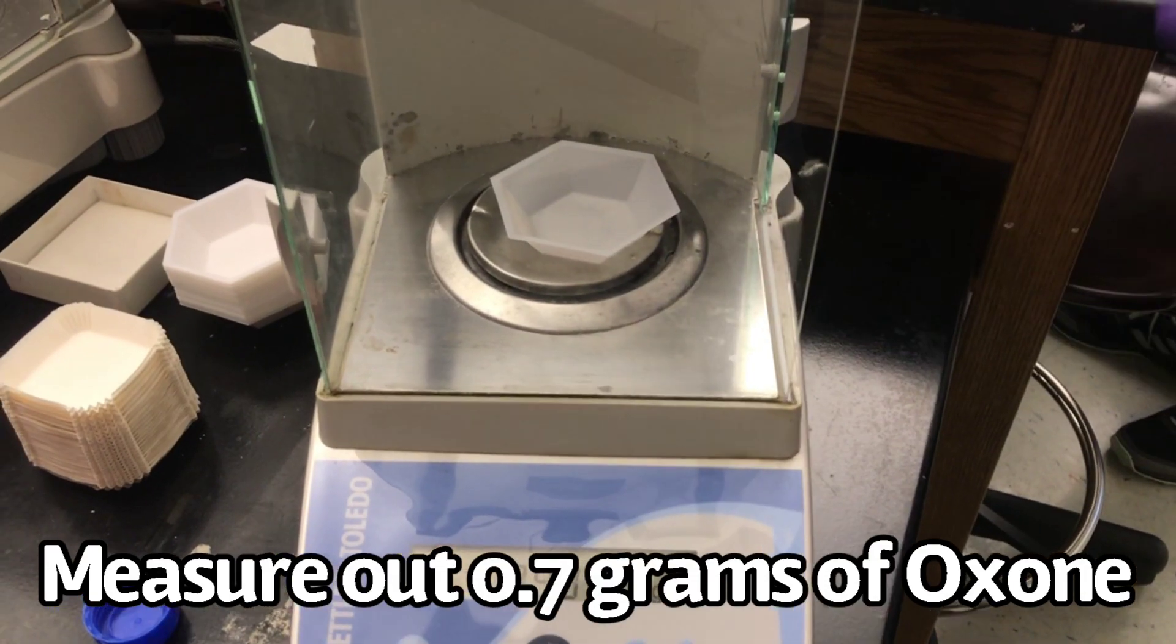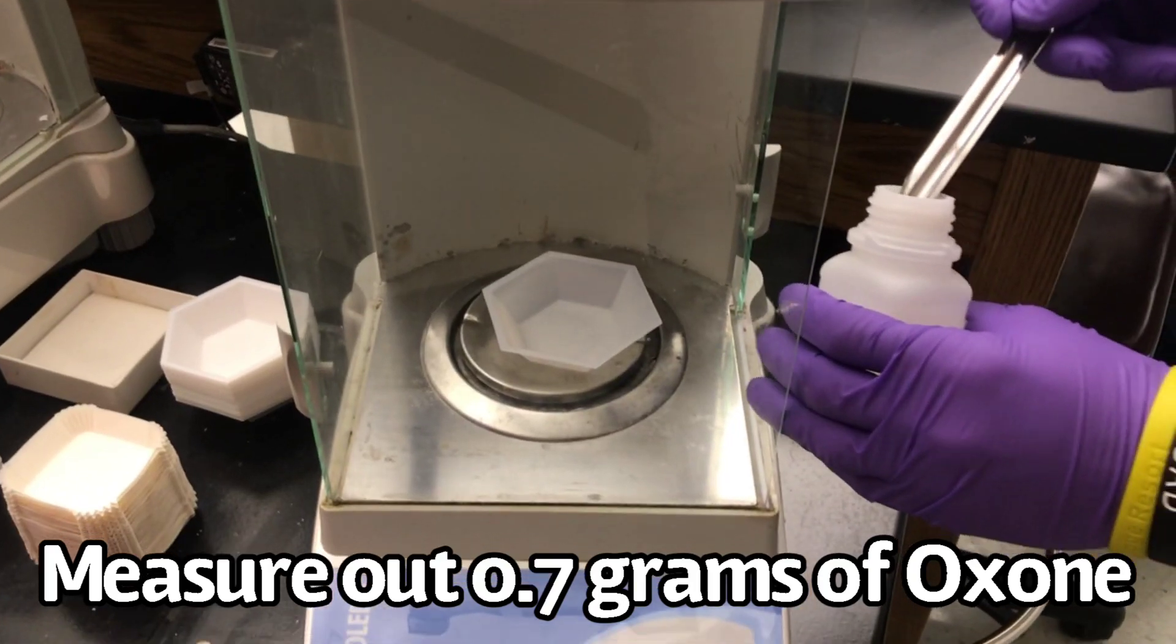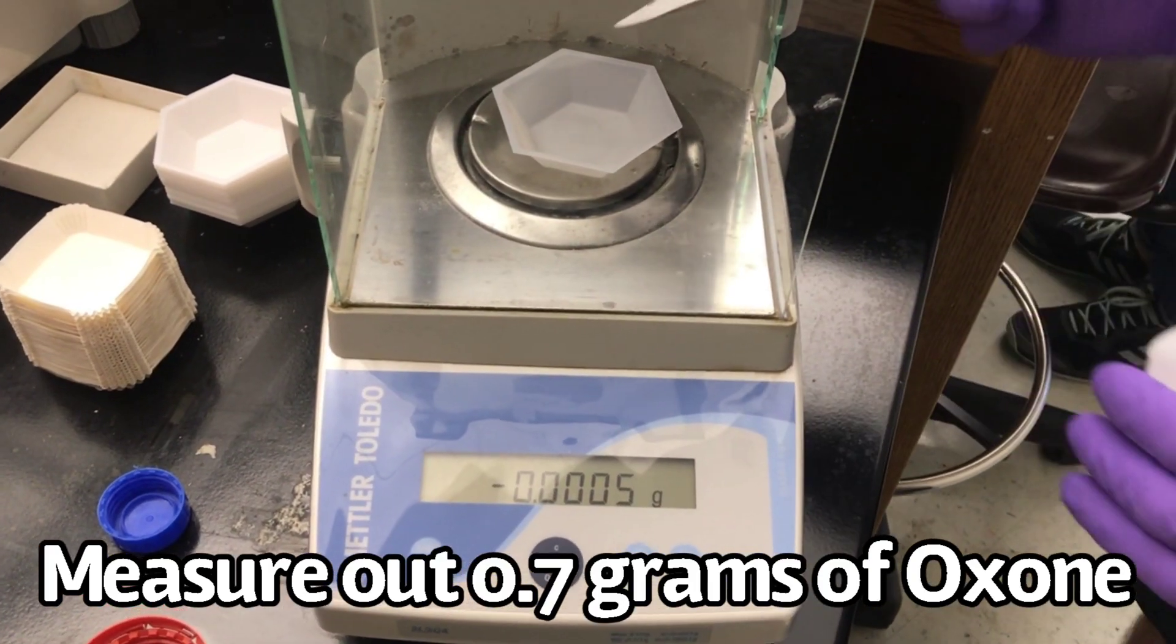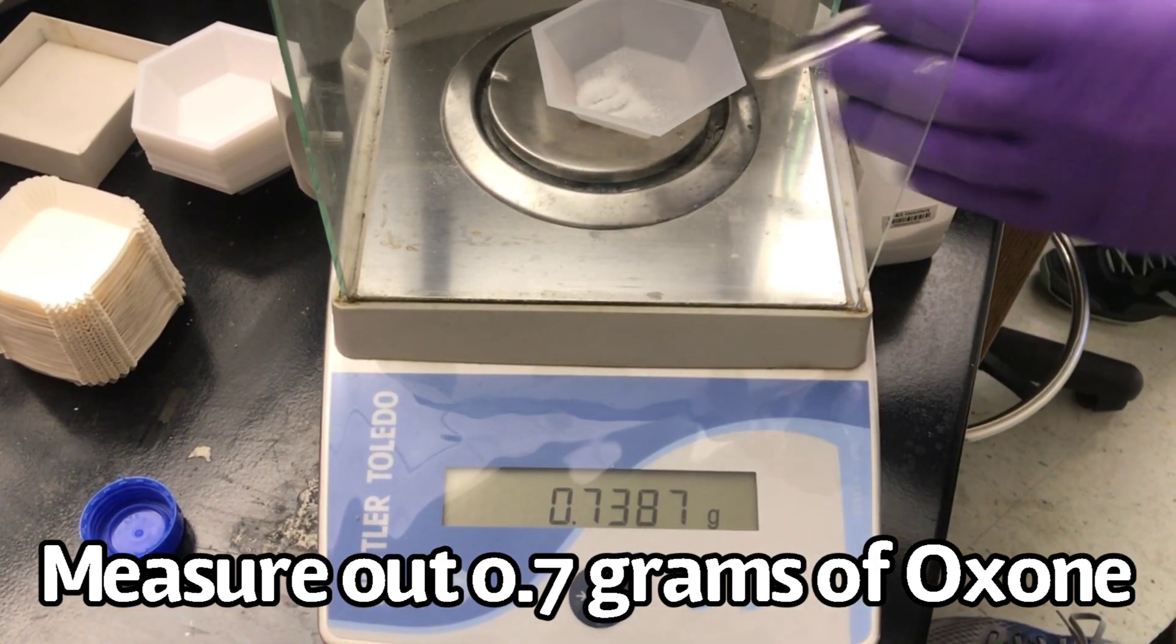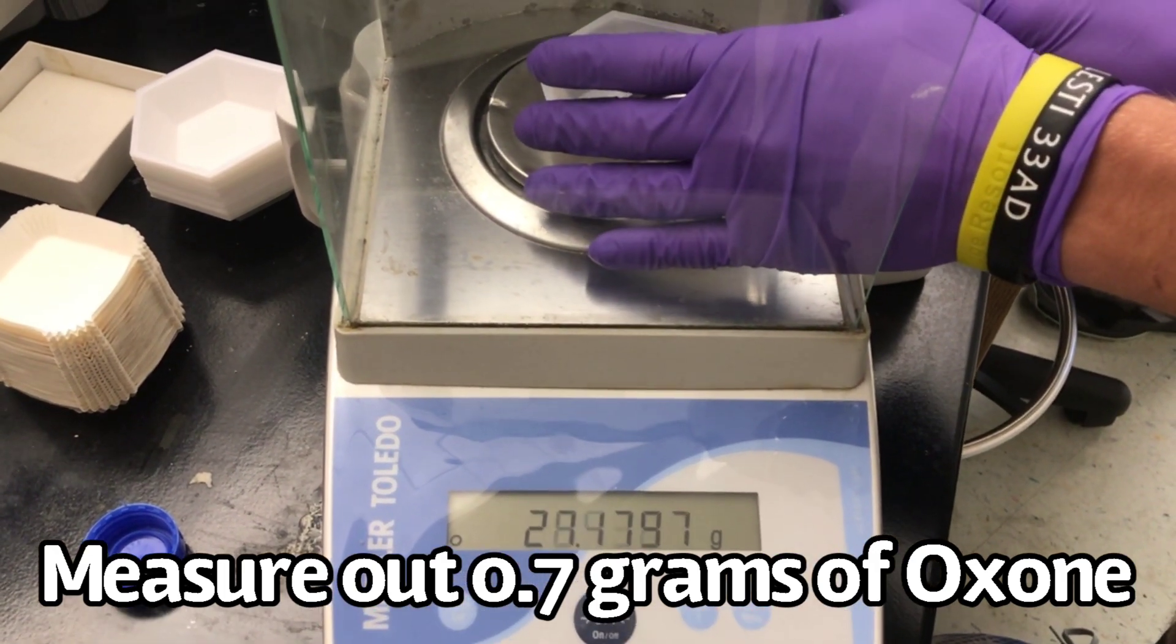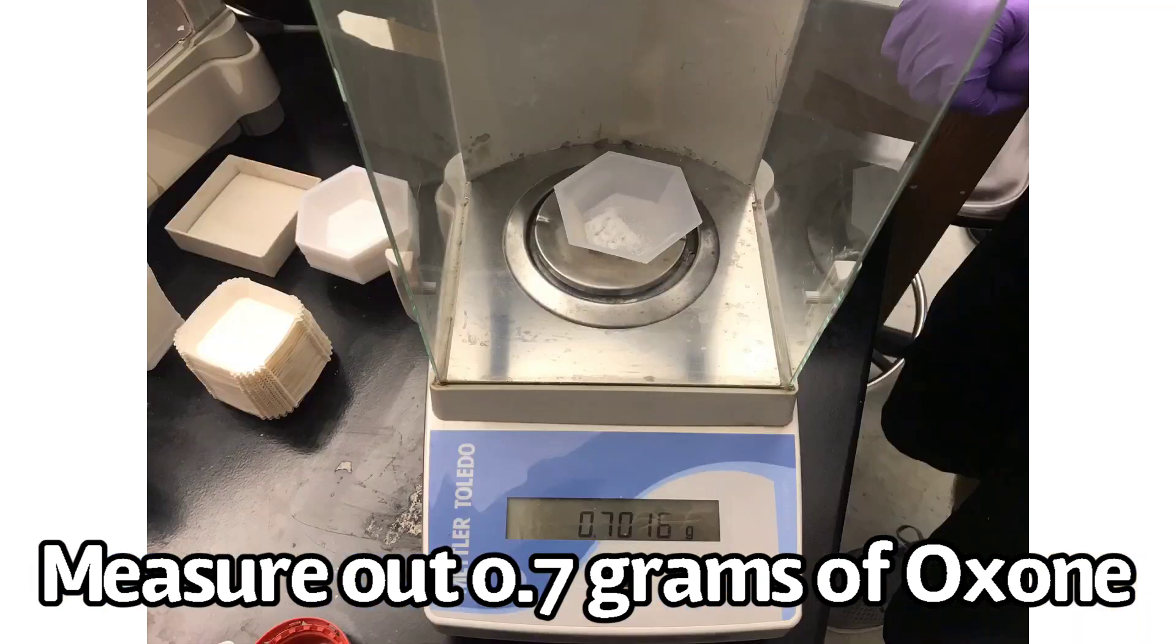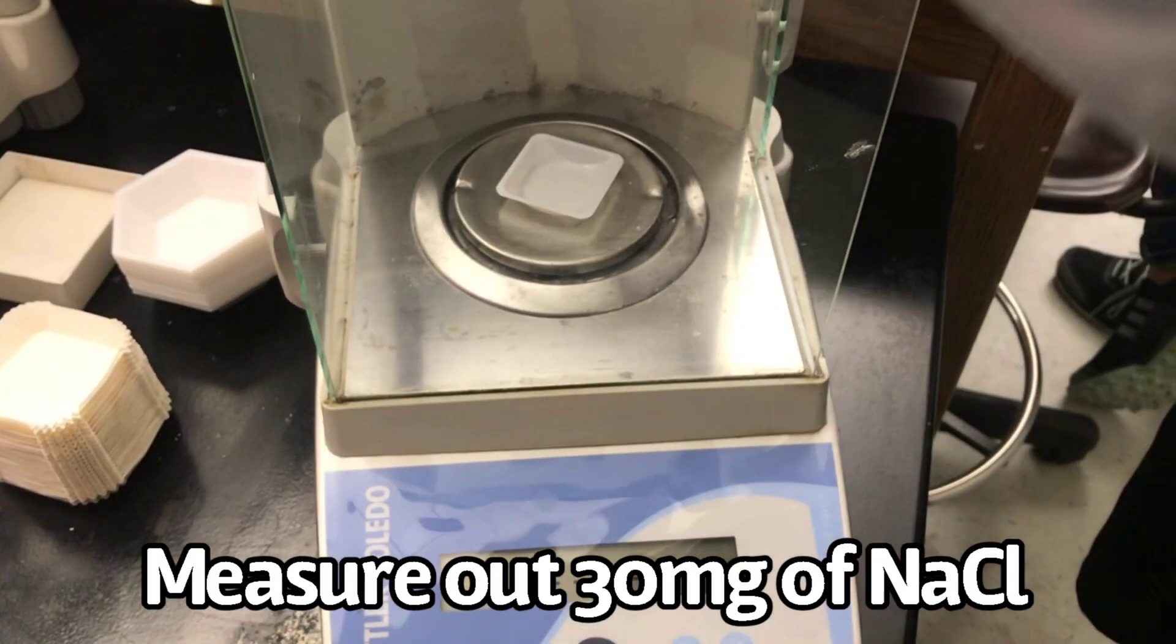Measure out 0.7 grams of oxone. Next, measure out 30 milligrams of sodium chloride.